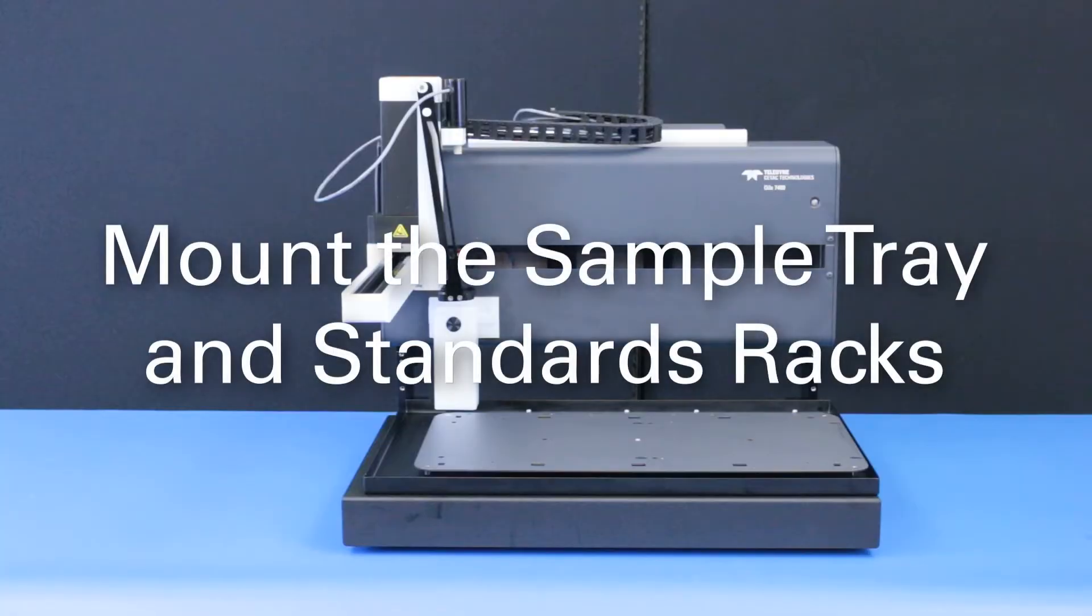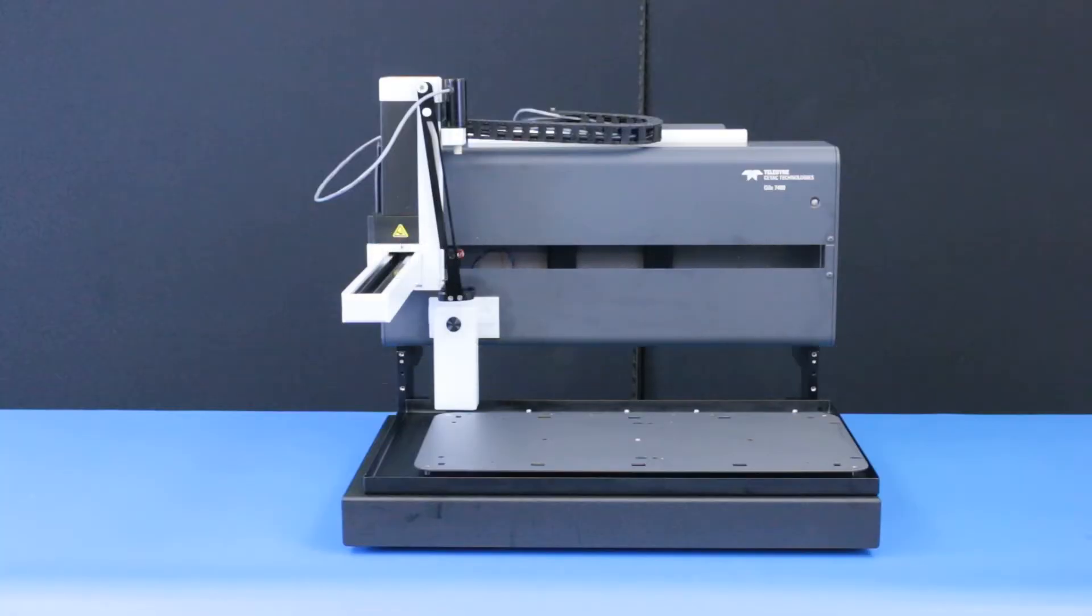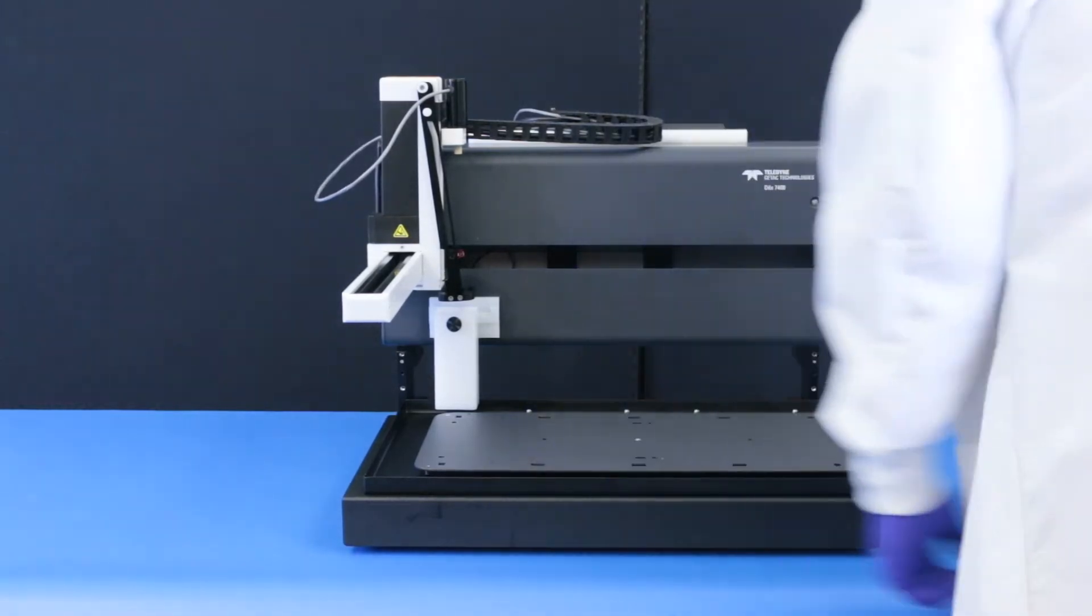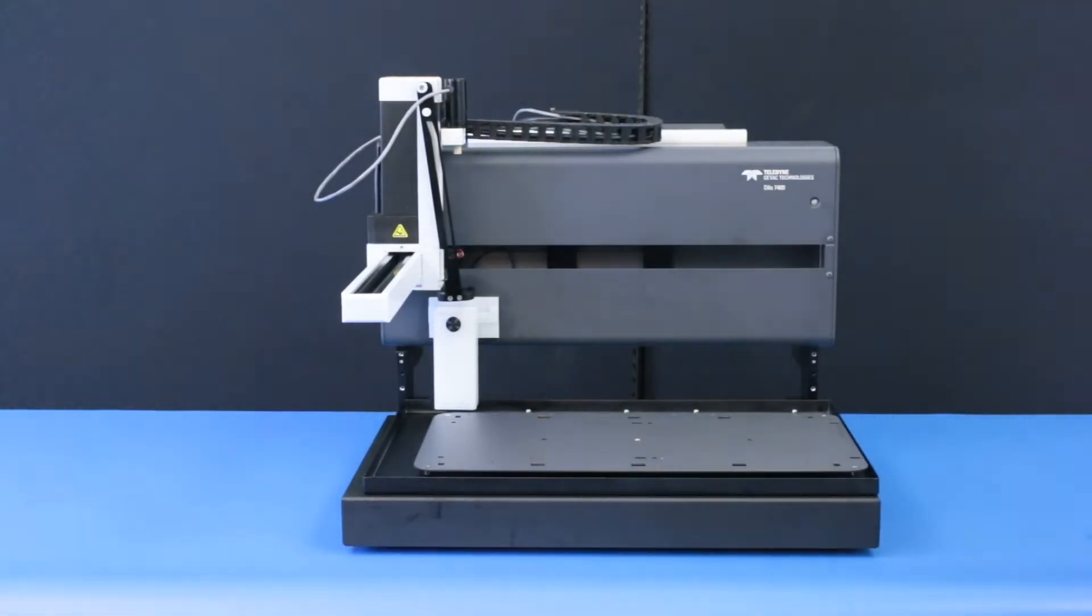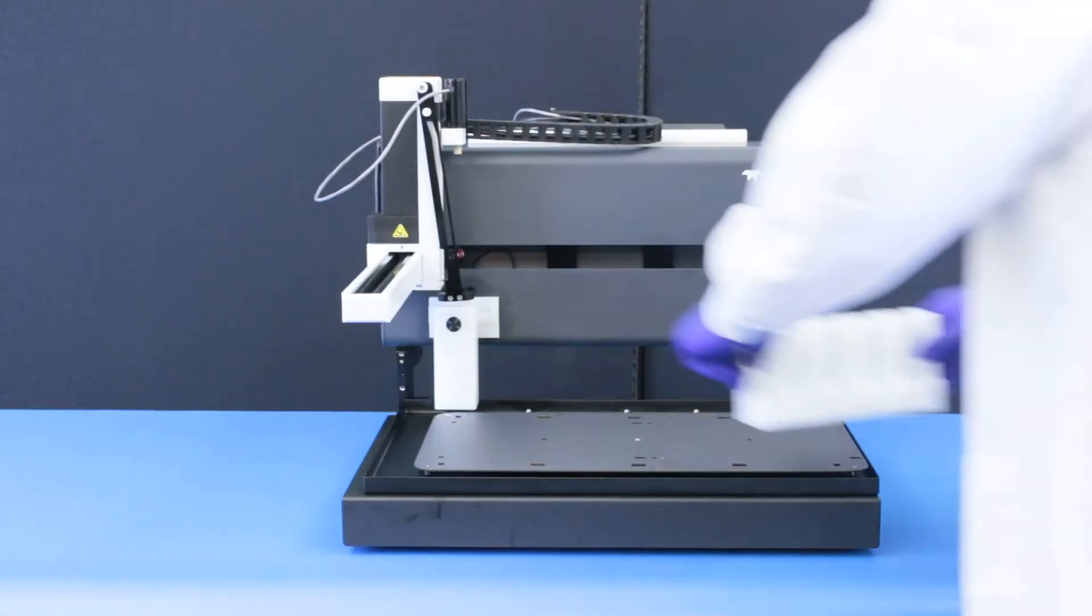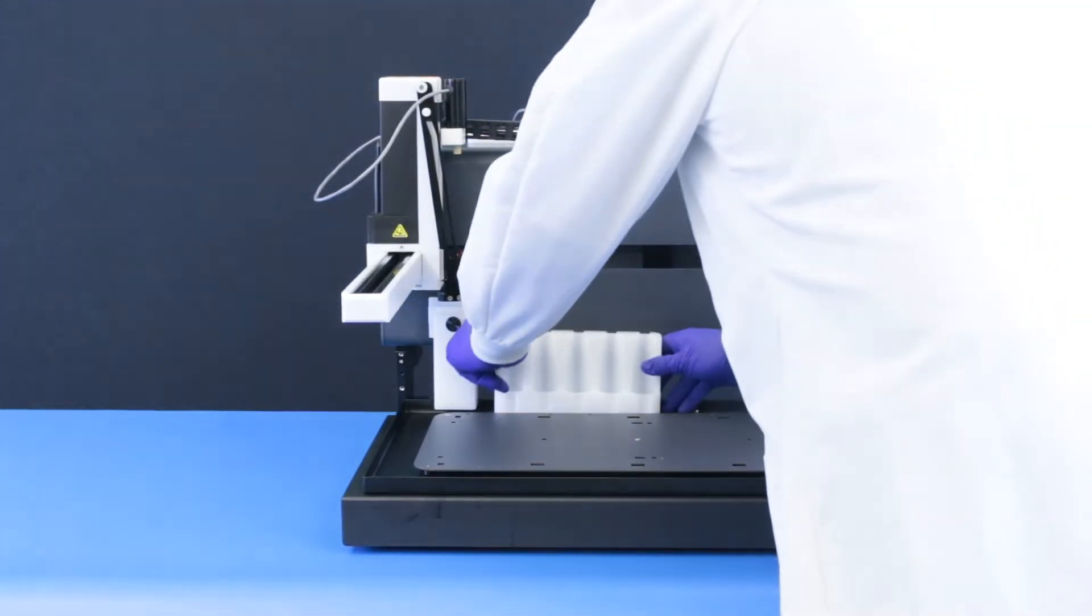Mount the tray and standards racks. The tray ships already installed, but it may come loose during shipping, so check that the tray is securely seated on the base of the Auto Sampler. Insert the standards racks at the back of the tray.